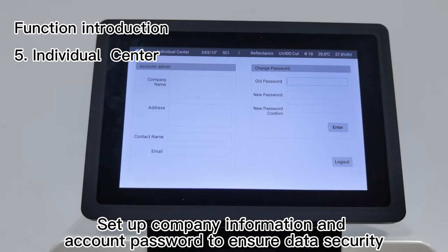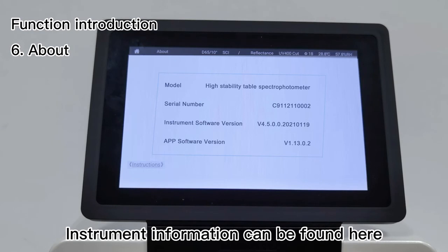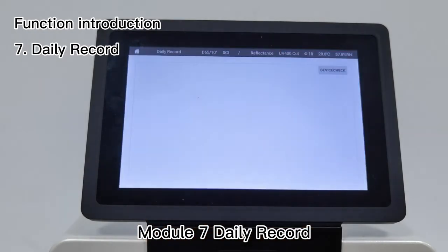Module 6 - About: Instrument information can be found here. Module 7 - Daily Record: The operation of the instrument is recorded in the log.